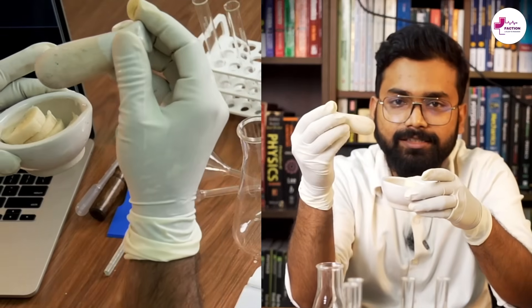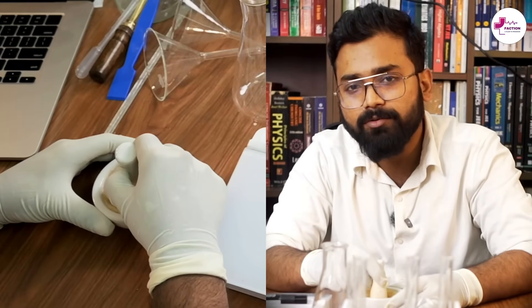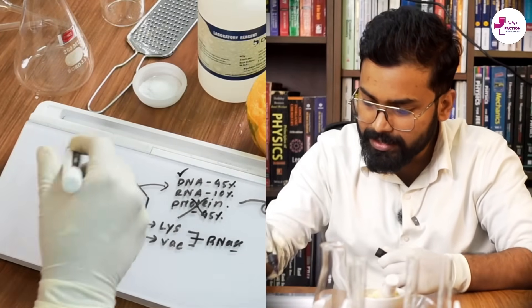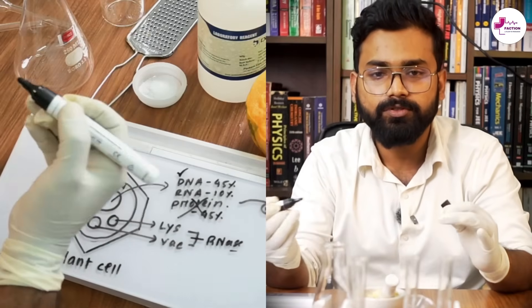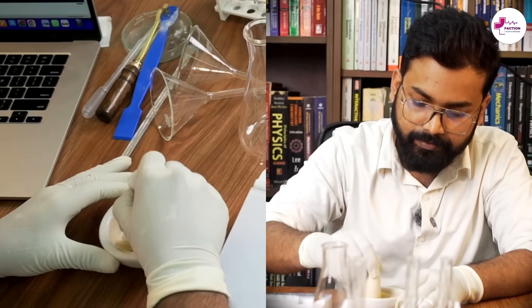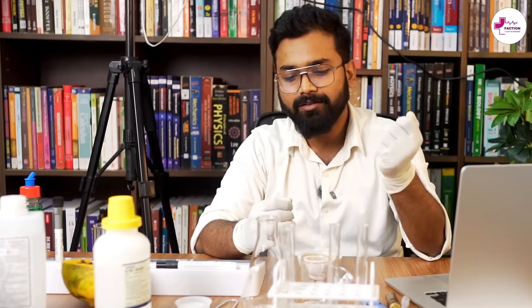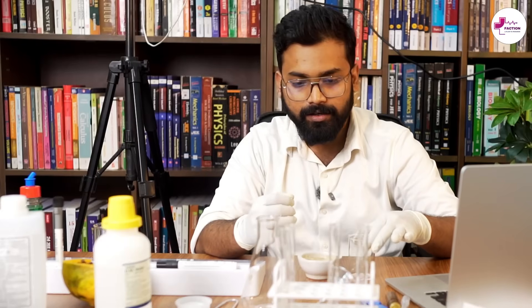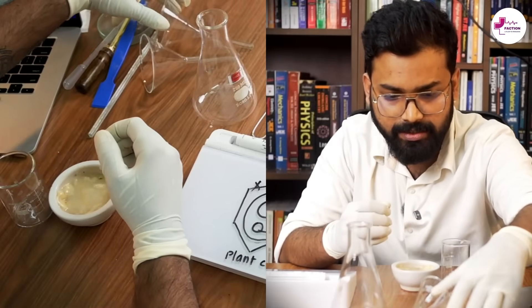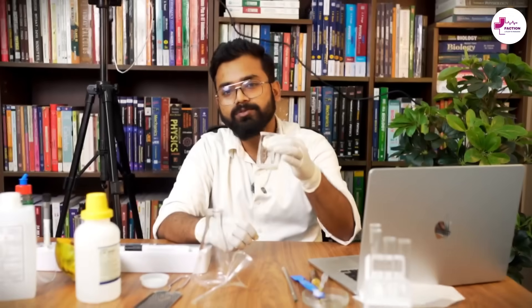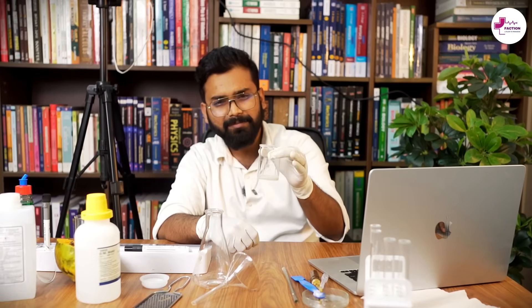I will grind the banana using a pestle and mortar. While grinding, we assume that the cell wall is being broken down by mechanical force. Our banana paste or extract solution is now ready. I will pour it into a beaker using a funnel and strainer to collect the extract.